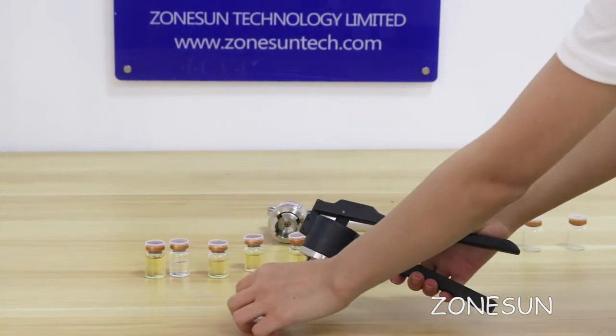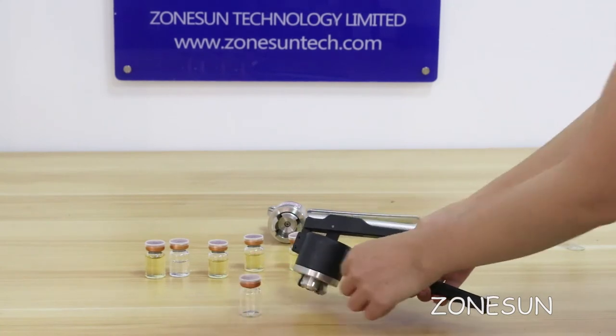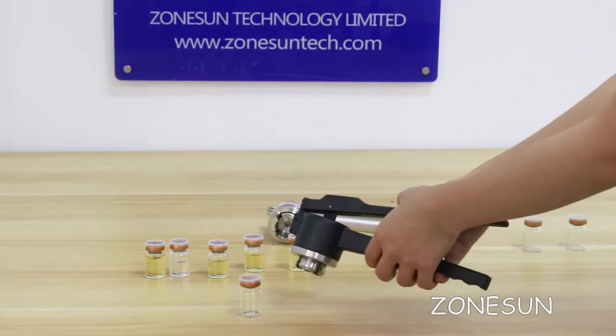In other situations, if you press the head and it is too tight, please rotate the head clockwise.